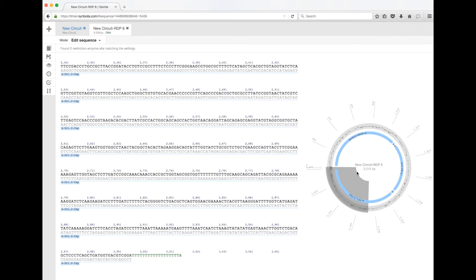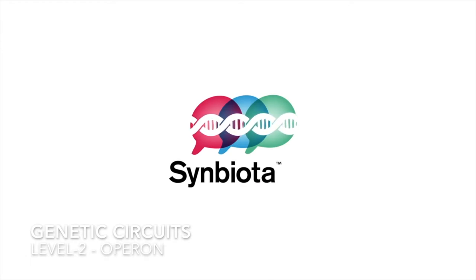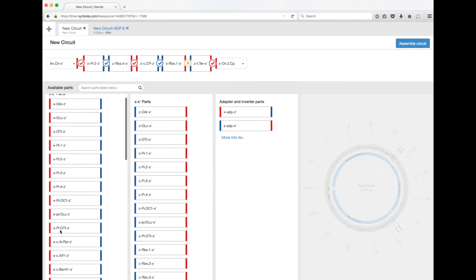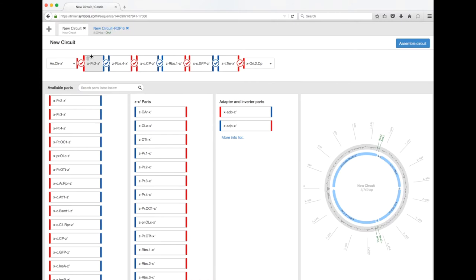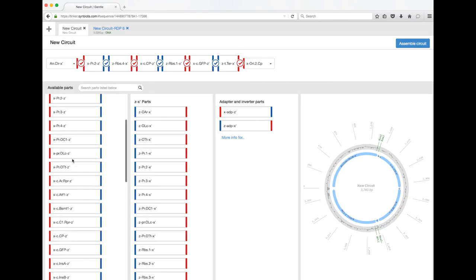That's building a circuit 101. If you want to build a more complex circuit — a level-two circuit — you can create what's called an operon. The way you do that is to use a single promoter followed by an RBS and a coding sequence, and then add another RBS and another coding sequence, for example GFP, after it. Under the control of a single promoter you can express multiple coding sequences. You must always have an RBS in front of each coding sequence, but you can use a single promoter. That's called an operon.